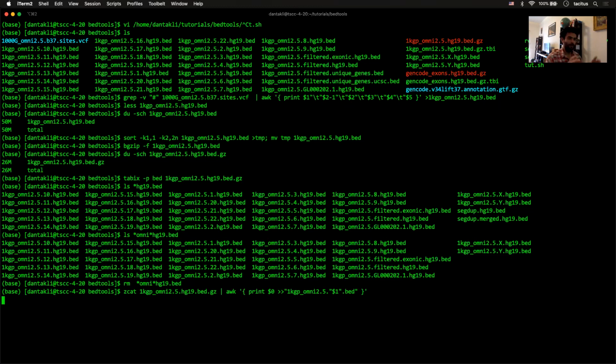And that's it. It almost looks like the command wouldn't really do this, right? When I first learned about this, I was kind of skeptical, like, really? But it actually does it.